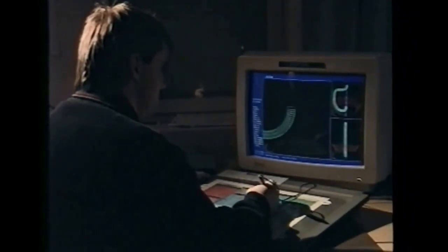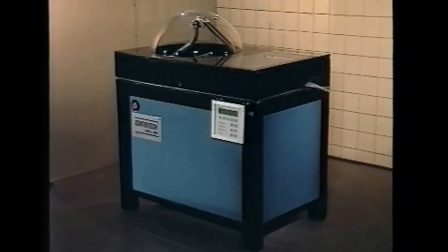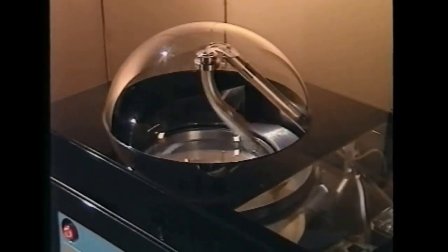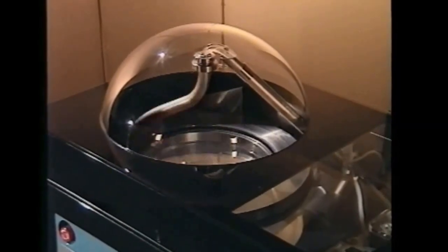The answer is the Centritech cell, a revolutionary new concept in cell separation, ideally suited to applications involving mammalian cells and also offering significant advantages over traditional methods in many other applications.